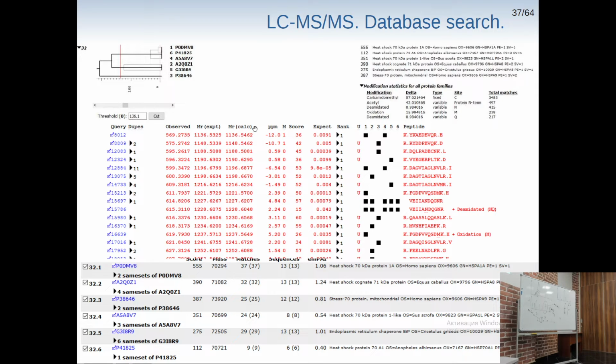Let's actually think about a different situation. For instance, you are working with human cells and you've got some protein from human cells, but there is also a hit from the database for the same protein but from some, let's say, penguin. Is it probable that your sample can be contaminated with a penguin protein? Mostly not, right? So even if the hits are about the same, in this case you will have to use just common logic, right? But if it's cat, dog, probably some contamination.